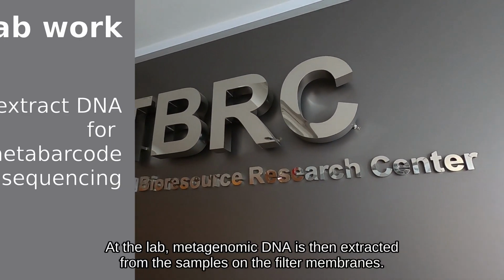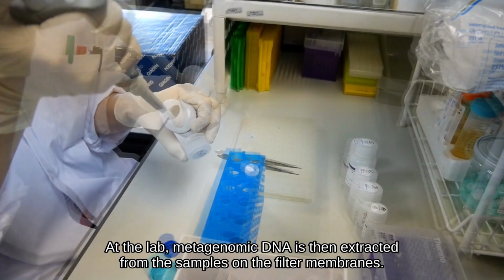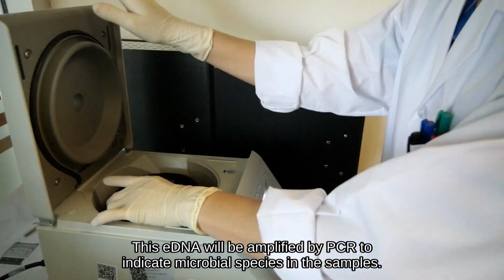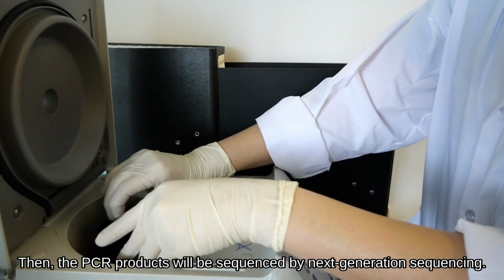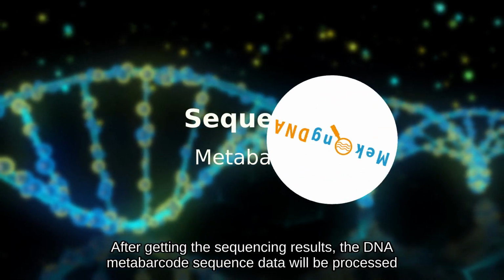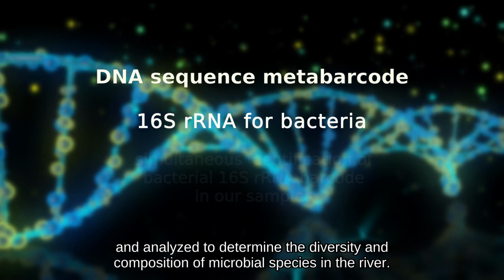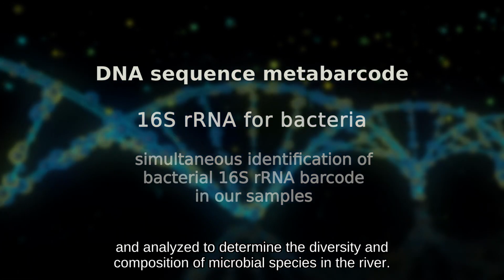At the lab, metagenomic DNA is then extracted from the samples on the filter membranes. This eDNA will be amplified by PCR to indicate microbial species in the samples. Then, the PCR products will be sequenced by next-generation sequencing. After getting the sequencing results, the DNA metabarcode sequence data will be processed and analyzed to determine the diversity and composition of microbial species in the river.